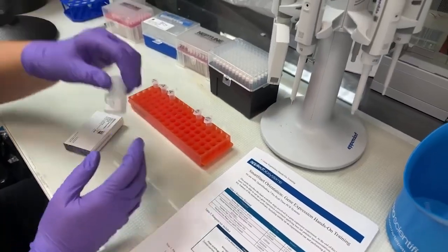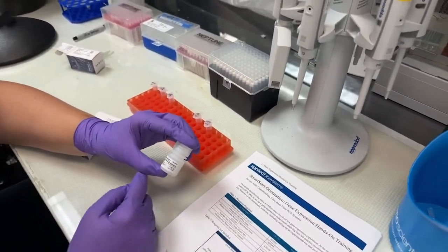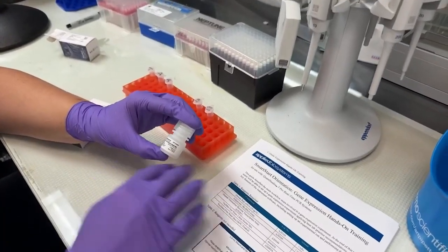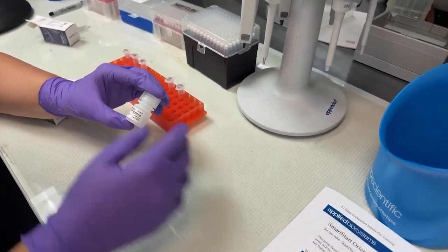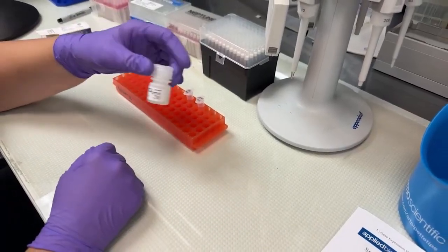If you're going to be sitting for a long time, you want that to be kept on ice. So this is a 2X formulation. We're going to prepare 10 microliter reactions today. So half of that, 5 microliters, is going to be the 2X master mix.